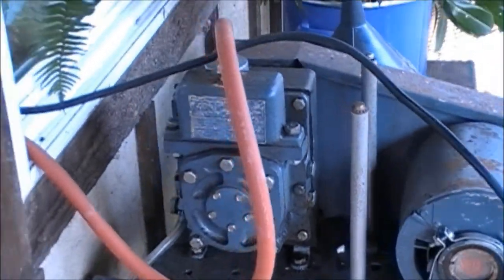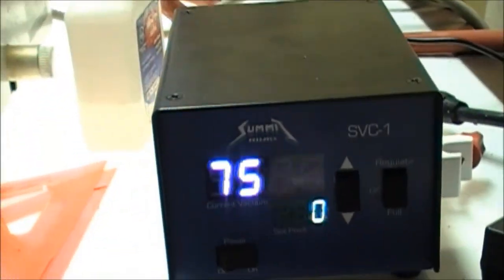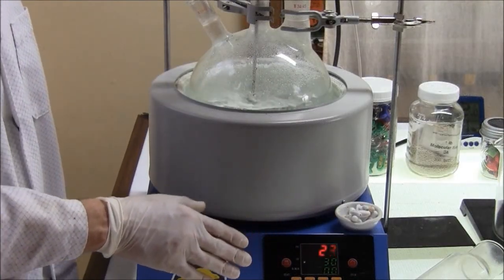And we use this Welch pump outside here to induce vacuum into our apparatus while we're doing our distillation. That drops the boiling point of the water, really helps reduce the amount of oxidation that occurs while we're distilling the terpenes.